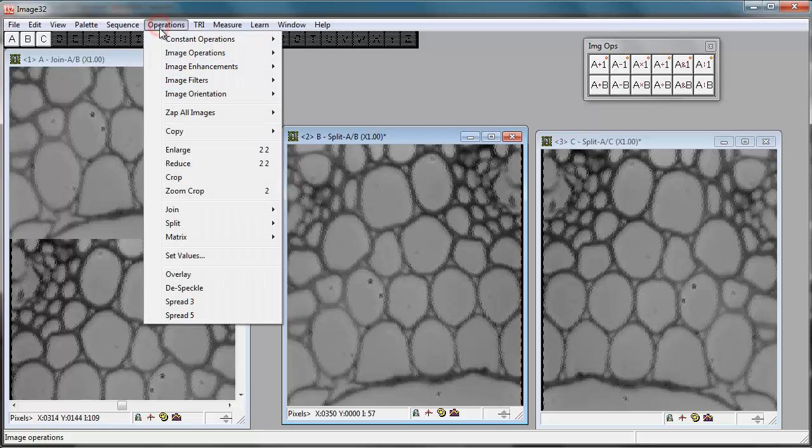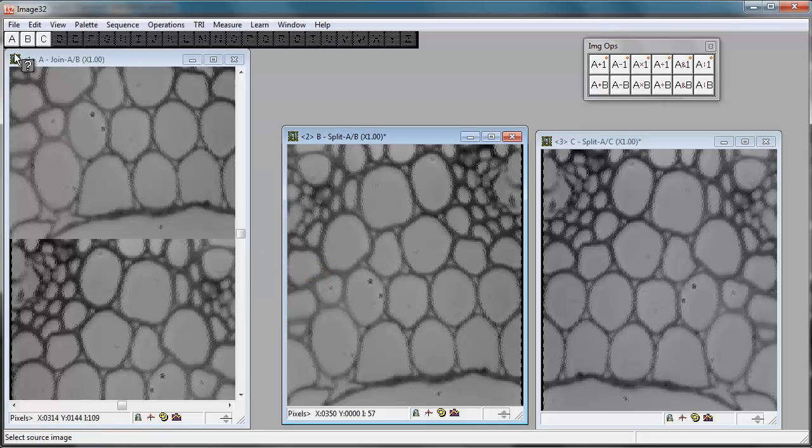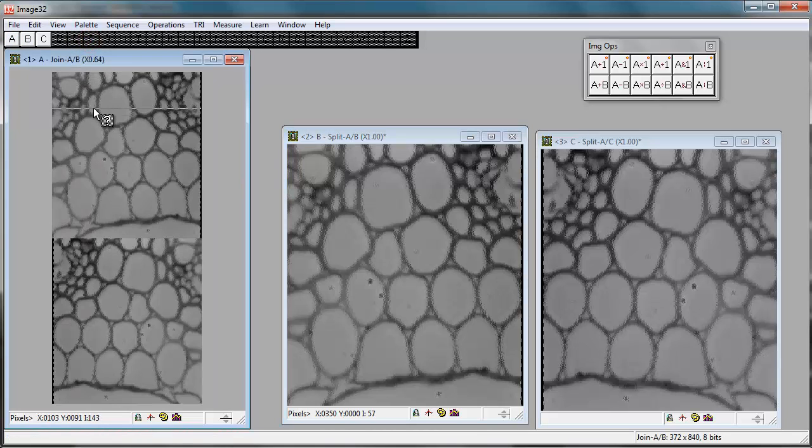If you want to, you can also split them at a different position. So I'll select vertical select, and again we're going to go image buffer A, and we'll put them into E and F, and we now get presented with a line which is the split point.